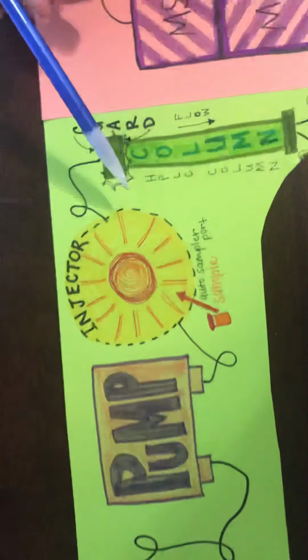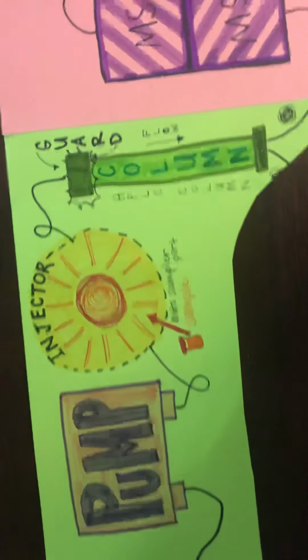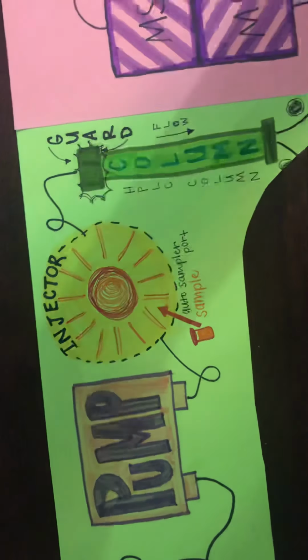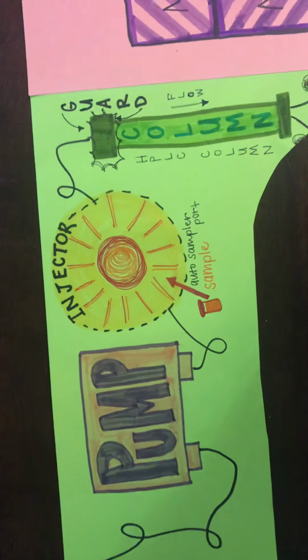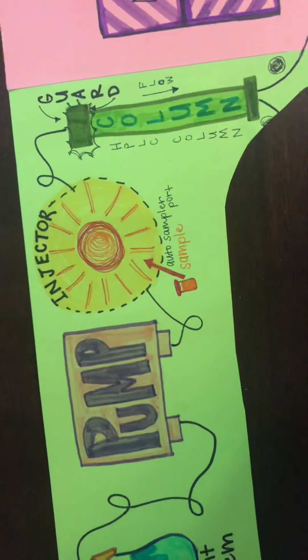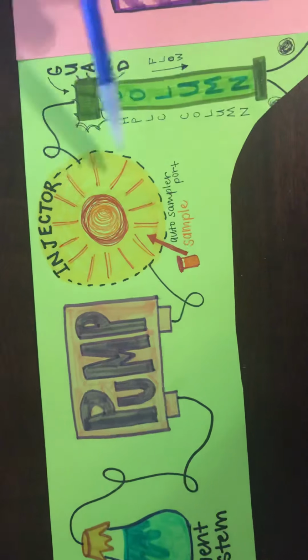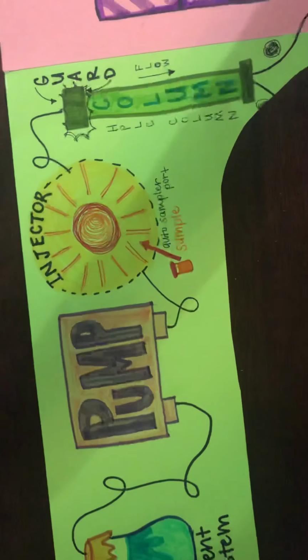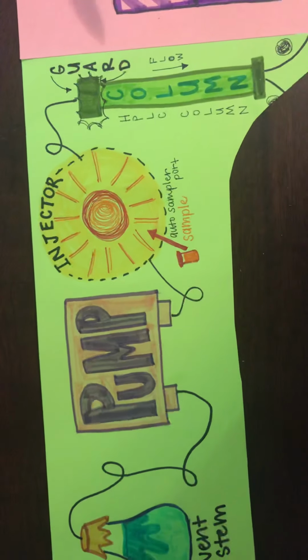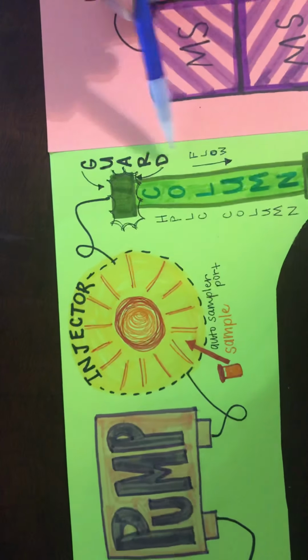So from here, we go to our HPLC column, which we have the guard, which is at the beginning with the column. And with the guard and column of our HPLC, the column is anywhere from 5 to 25 centimeters in length, and it is made of stainless steel. And it's made of stainless steel because this allows it to have protection and to withstand the high pressures that are coming from our pump, the 300 to 400 bar pressure pushing the sample and solvent through the system. And the guard at the top up here, its job is to protect the HPLC column from contamination.